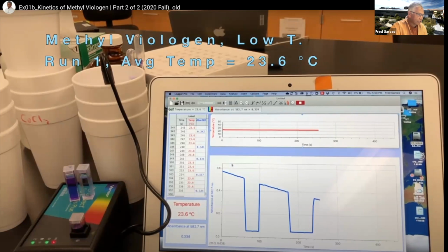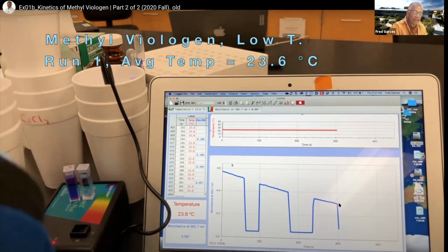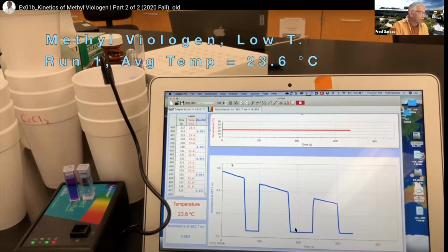And so you can see that what I need to record is data from this point, this point, this point, but not down here, because that's a 0 reading. This point, this point, this point, all along this curve is where I want to get my data from. So it's going to look like this, where you have the absorbance, drops down to 0, and then it gets back up. So let's just scrub through this that way.